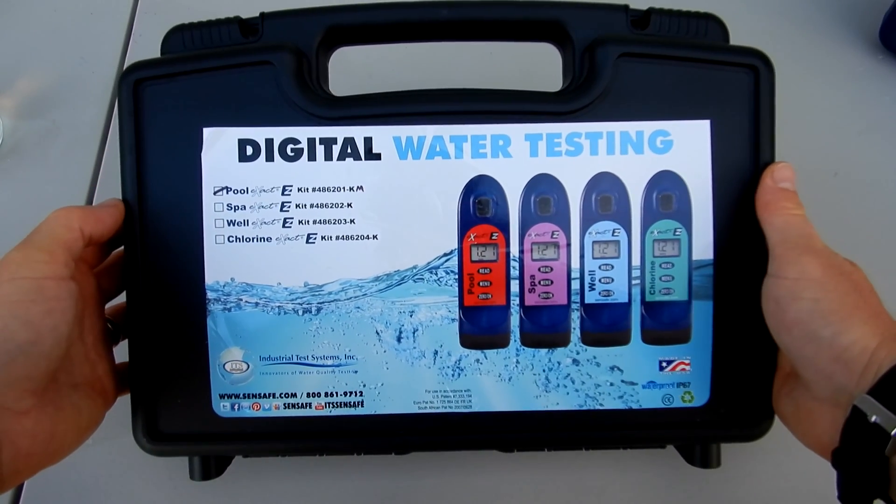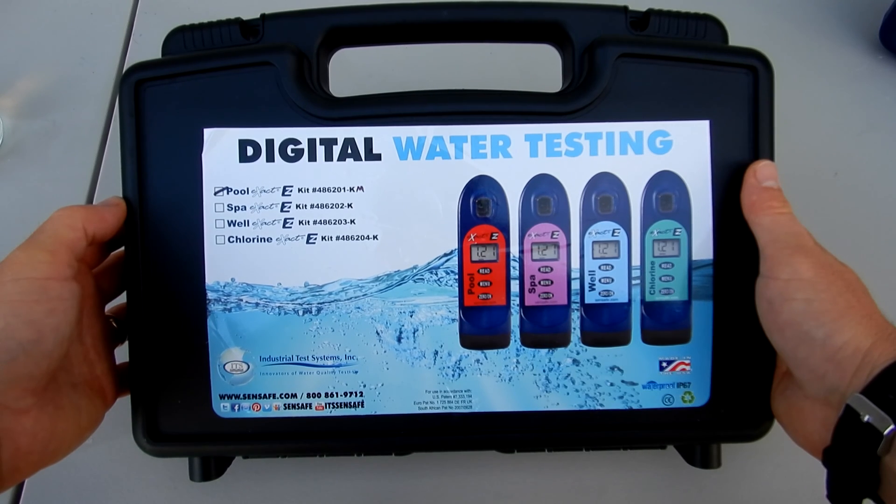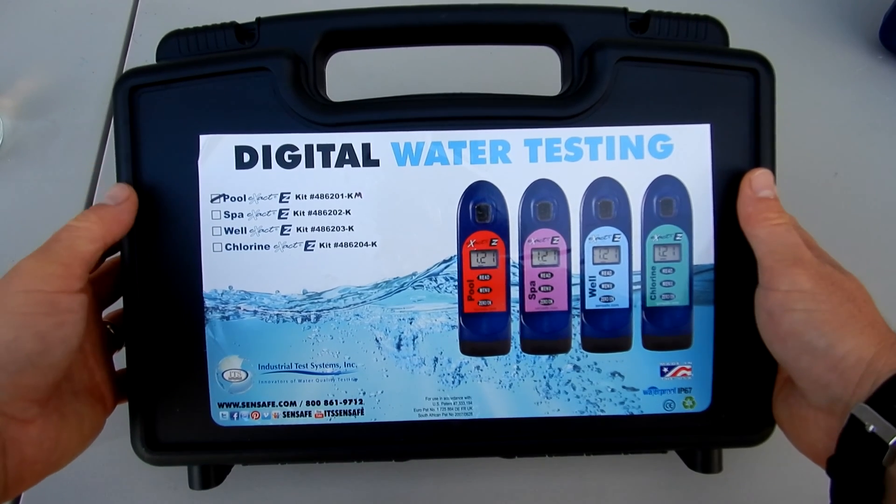In this video I'm going to show you the POOL EXACT EZ Photometer Master Kit 486201-KM. I'm going to show you what comes included with this kit.